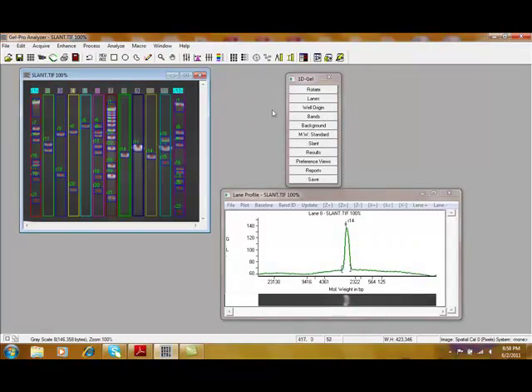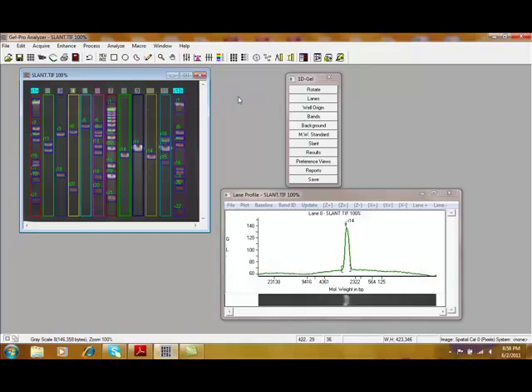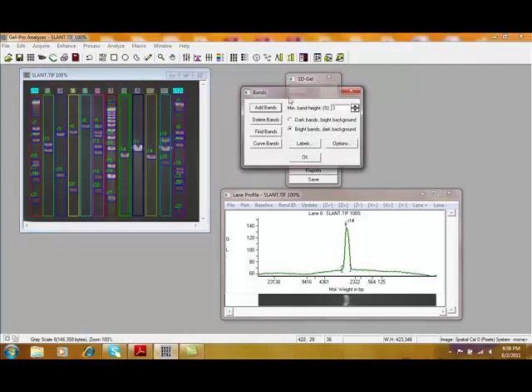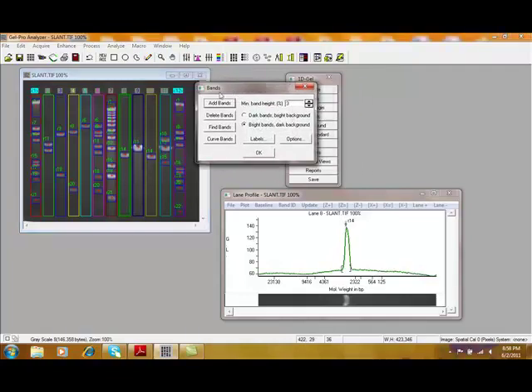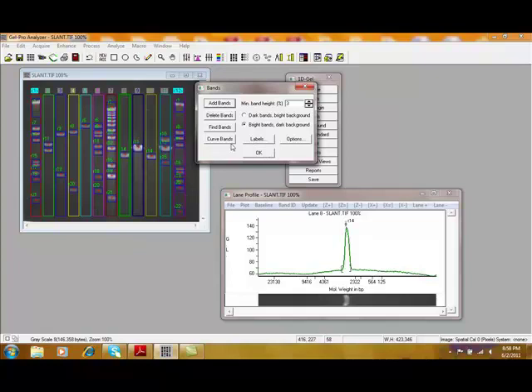The next step, if we choose to, is to define the well origin where the DNA was originally loaded. In this case, we don't need to do that. Next, if bands are missing, we can add bands. If we've done a good job detecting this, we will not need to do that. However, you can add bands. You can also correct for curved bands.